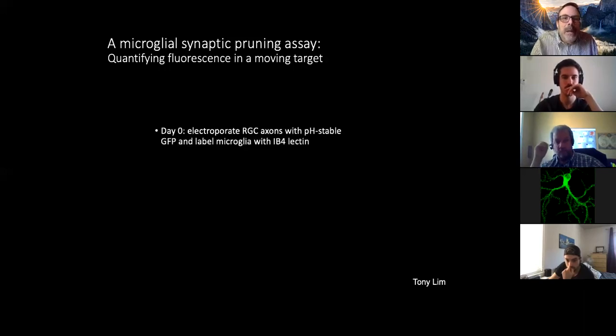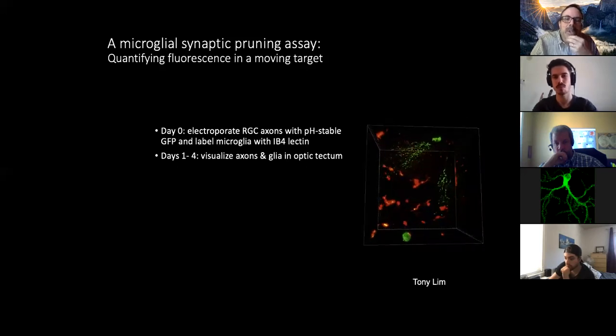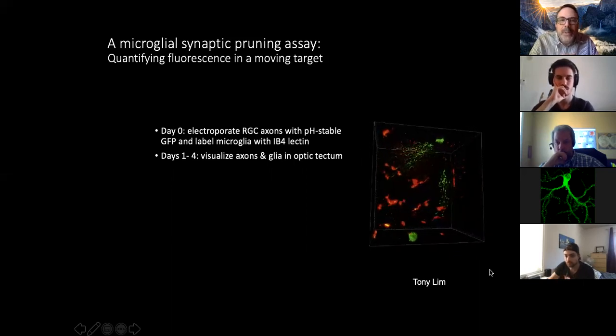So what he does is, on the first day, he electroporates retinal ganglion cell axons with a pH-stable GFP. He labels the microglia with IB4 lectin. And then he images in the optic tectum. So this is what you see. You see the microglia in red, two axons here labeled in green.